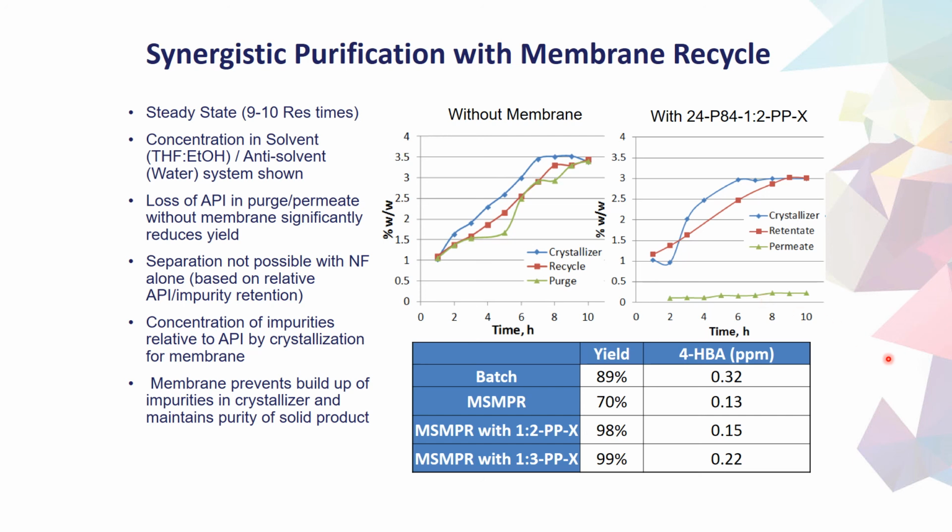There were further studies that used addition of complexing agents that did couple with the impurities to allow their preferential removal, even when the membrane wouldn't be able to discriminate between APIs and impurities. So a generalized technique for complexation and removal of problematic impurities was formulated in follow-up studies in the literature to this one.